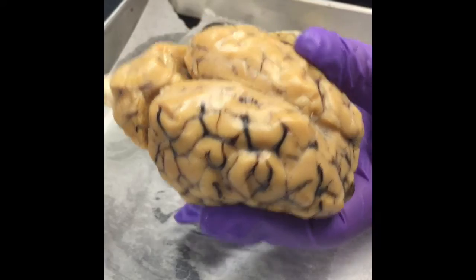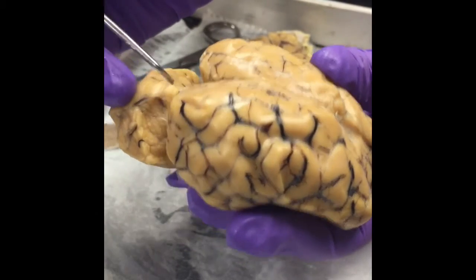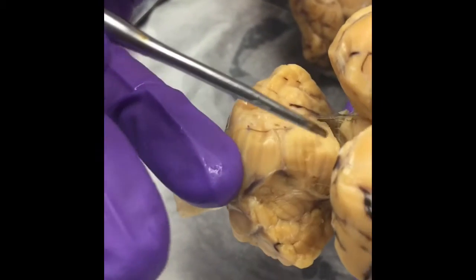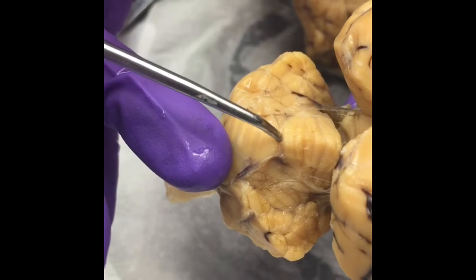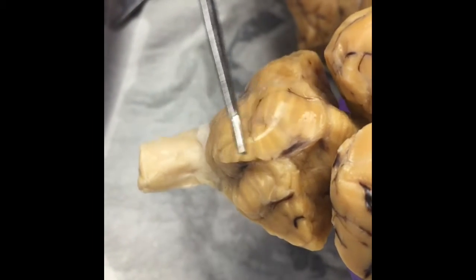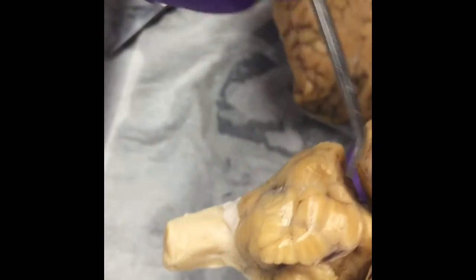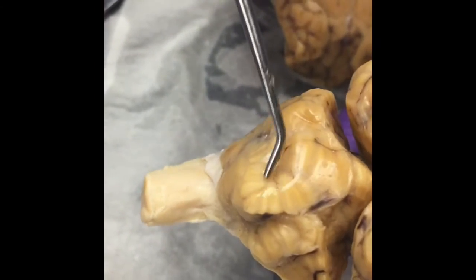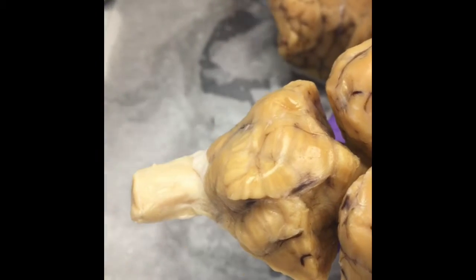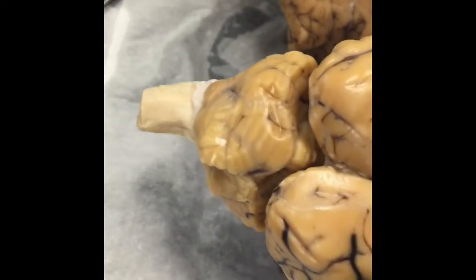It's still made up of neural tissue, but you'll notice that there's no gyri and no sulci. Instead, you have these flaps of tissue called folia, and they kind of stack up on each other like poker chips. Where it extends down the center and kind of bulges out, we call that section of it the vermis, which means worm. And you can kind of follow it. It squiggles back and forth down the center, much like a worm would look. It looks a little intestine-y to me. I could see that. You're not wrong.